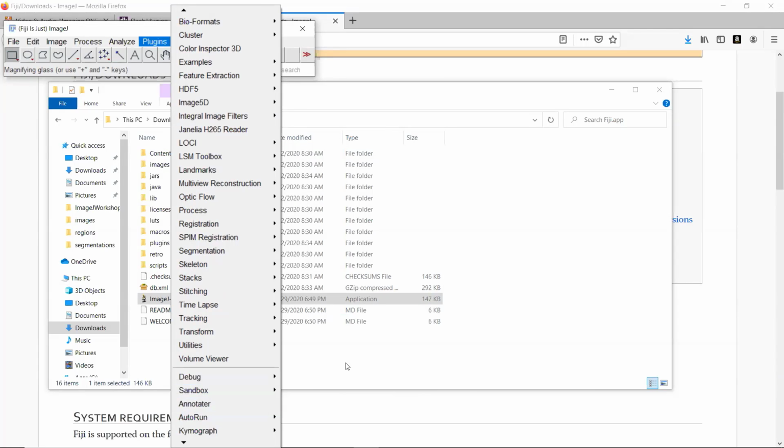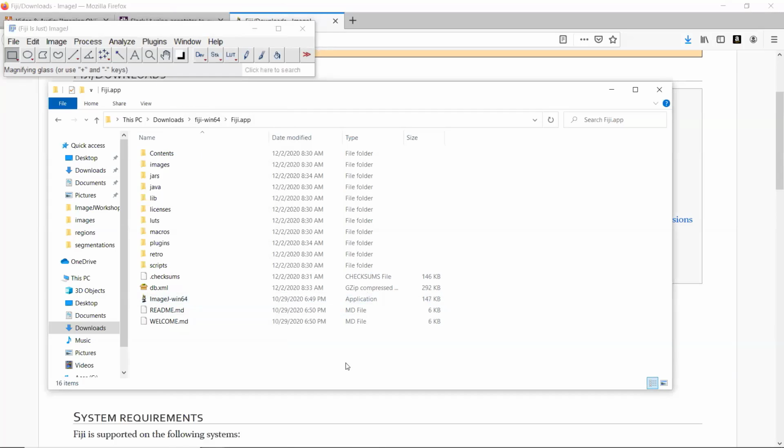Does everyone manage to install Annotator, or is there any problem? it's time now to check for it, because then we're going to use it. So I just want to make sure that everyone has an annotator.